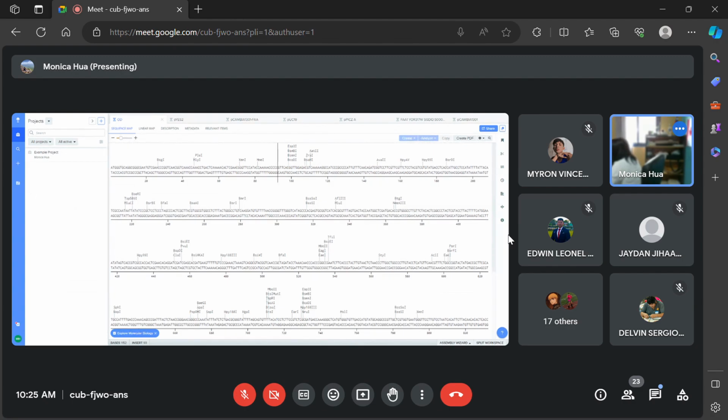I'm just gonna upload another sequence for myself.